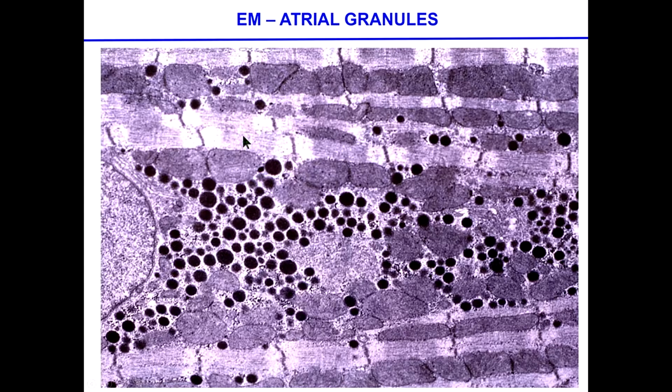But you can also use this picture to look at the overall structure of the muscle fibers, and then you can see everything we've been talking about before, the irregularity of the divisions and the step-by-step separation between cells. Questions?